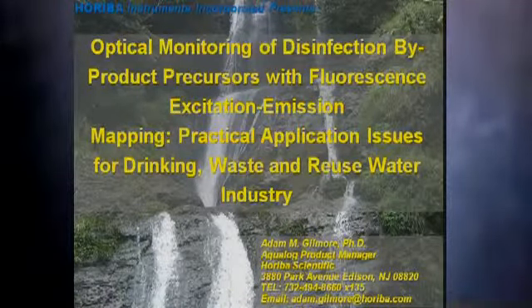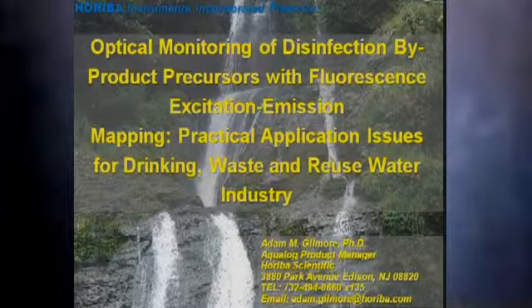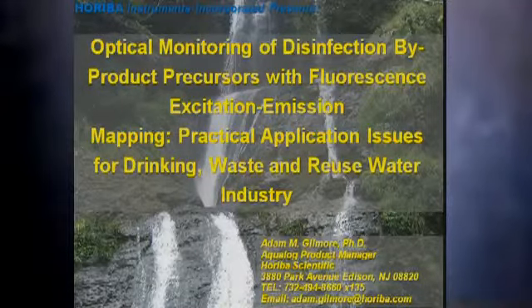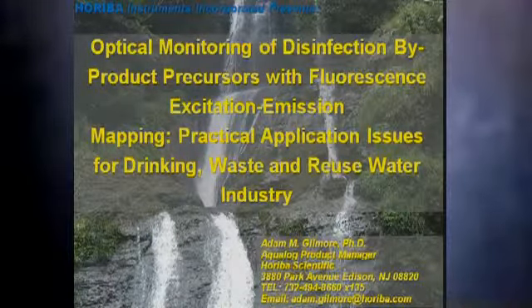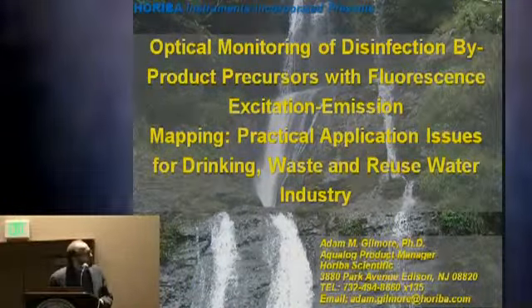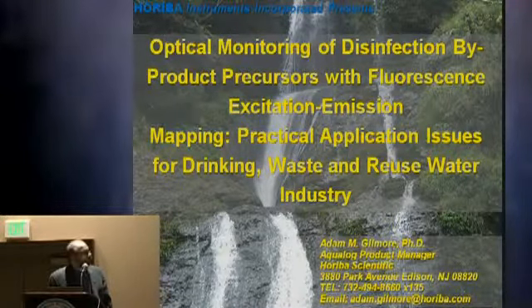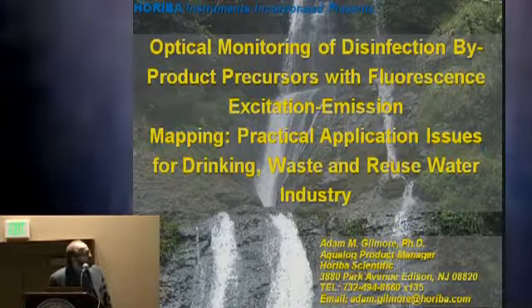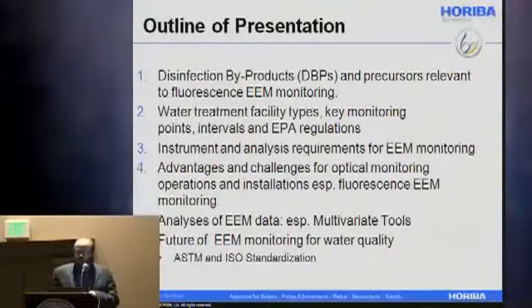Today, basically, what I want to focus on is some application of some recently improved fluorescence and UV-vis absorption technology for monitoring the precursors of the disinfection byproducts that are associated with natural organic matter present in drinking water, wastewater, and water reuse industry applications.